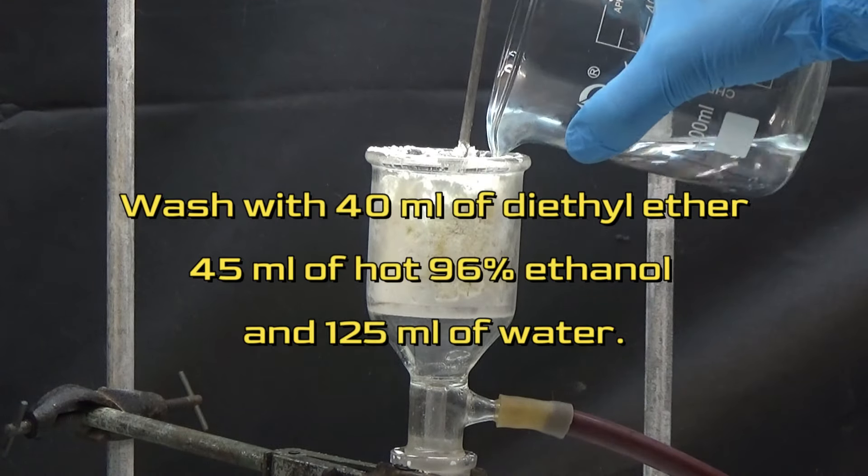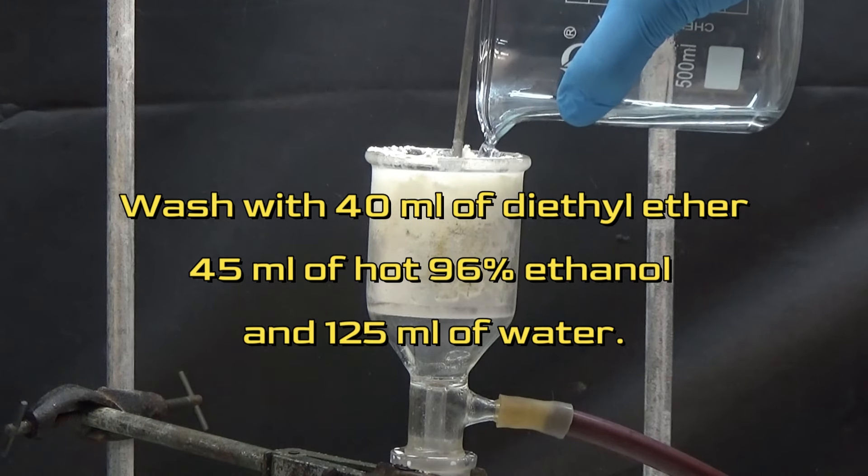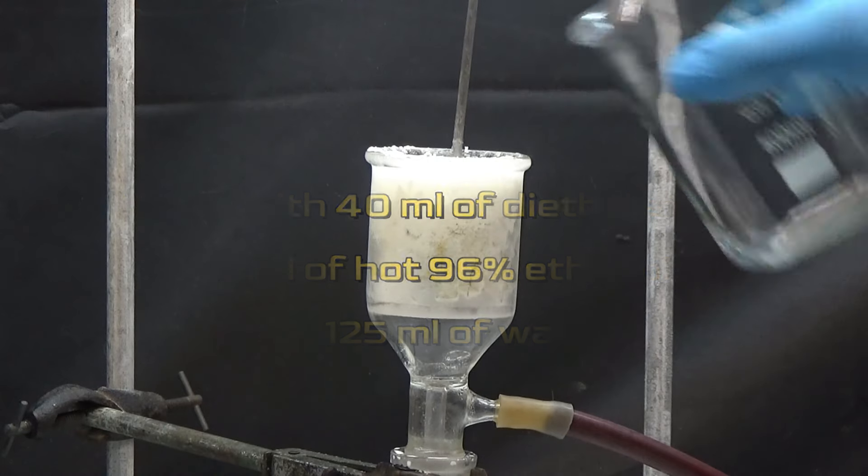Wash with 40 milliliters of diethyl ether, 45 milliliters of hot 96% ethanol, and finally with 125 milliliters of water.